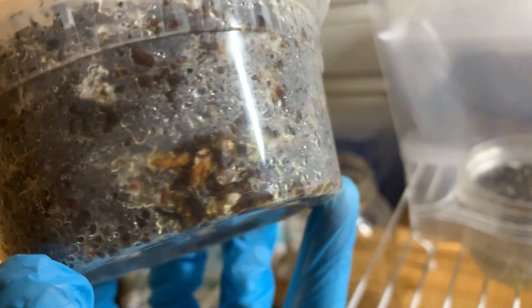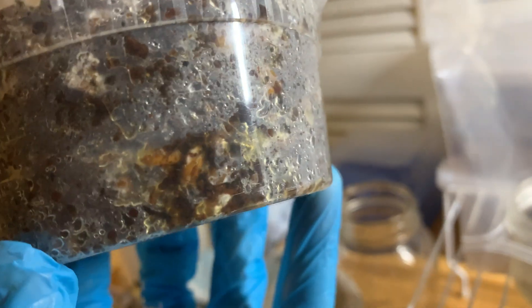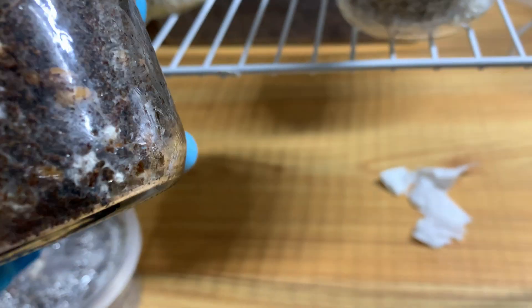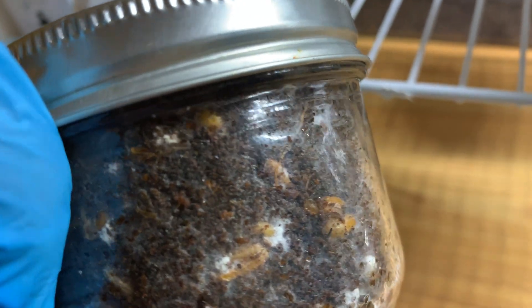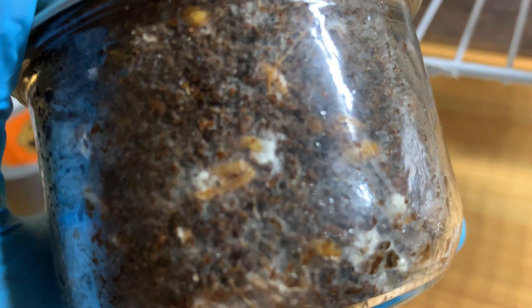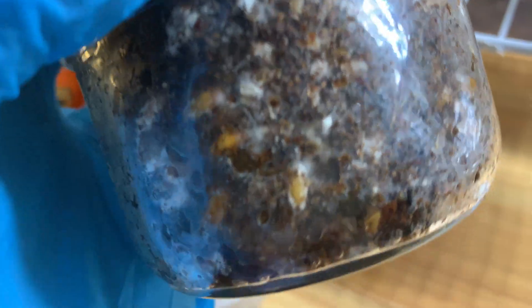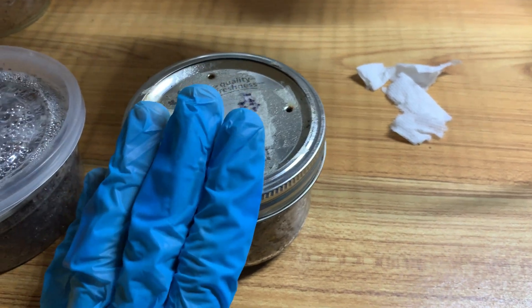Look at this — this looks suspicious. Something is definitely going on. Look at all the metabolites. Look at how it's not fully colonized there, or it's stalled. This is bad. And there's also what I reckon to be trich as well over here. Early signs of trich may be kind of hard to see. But I've seen enough trich now to basically know it as soon as I see it. It's hard to see on camera, but I suspect this is going to trich out soon.